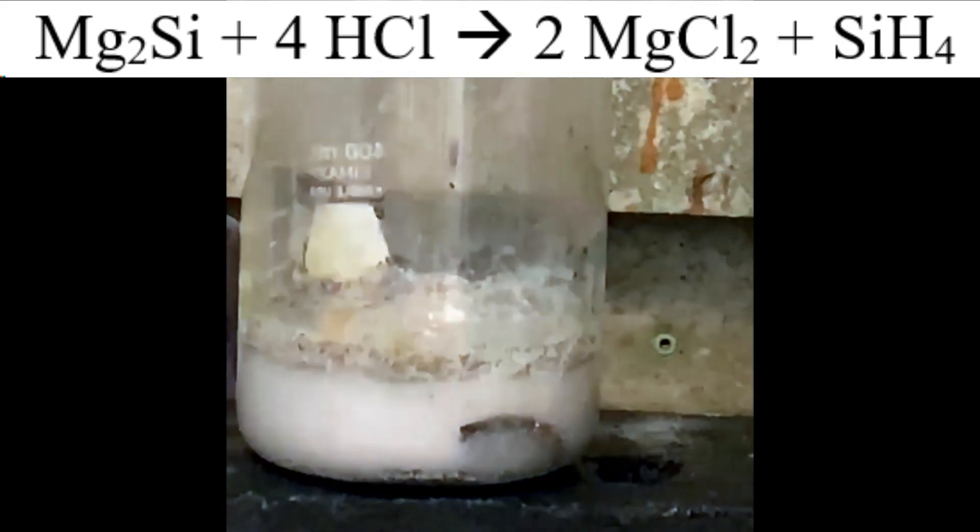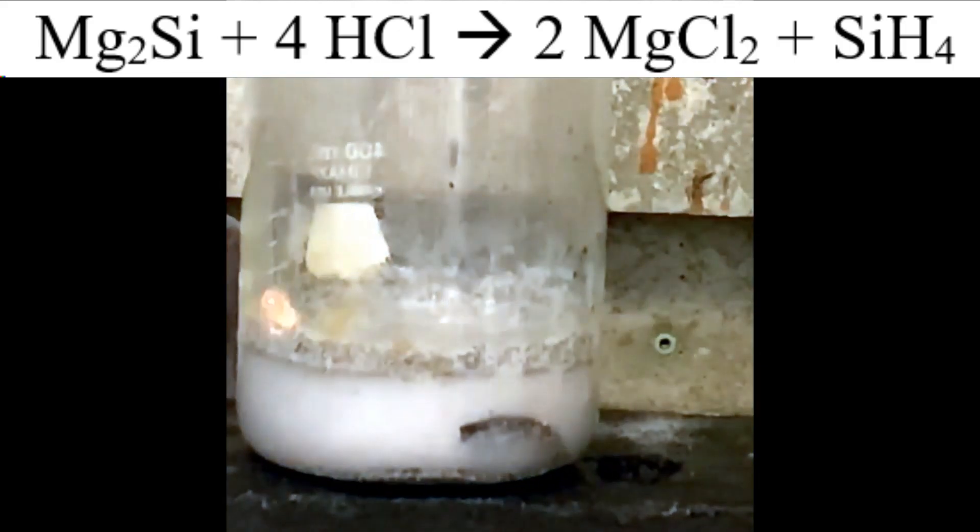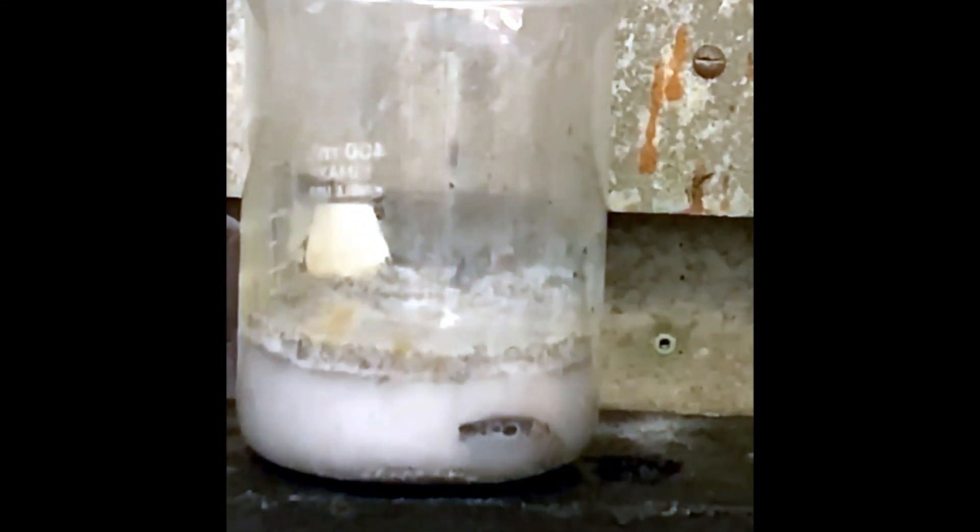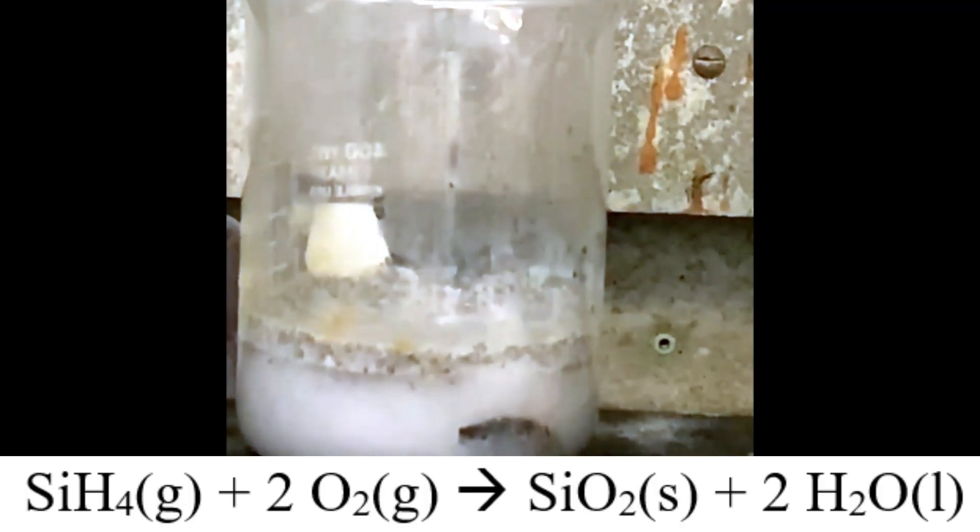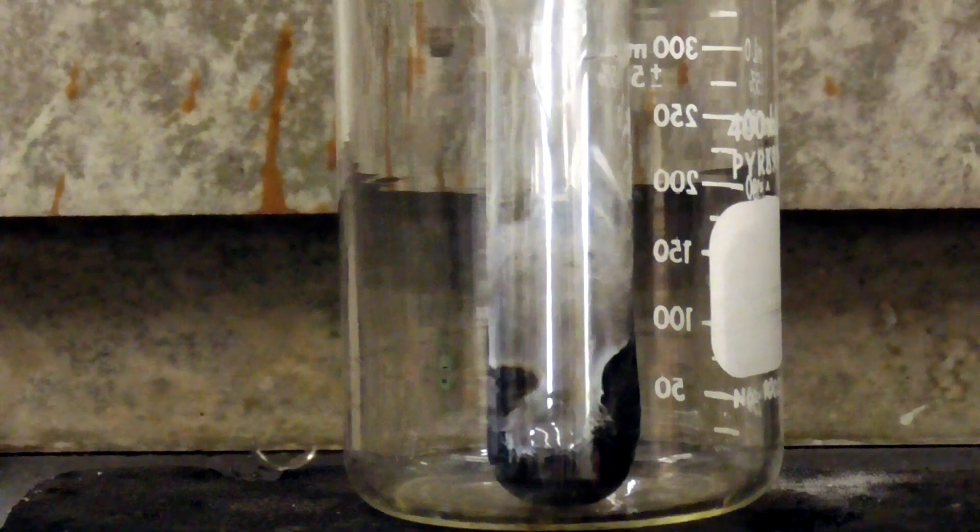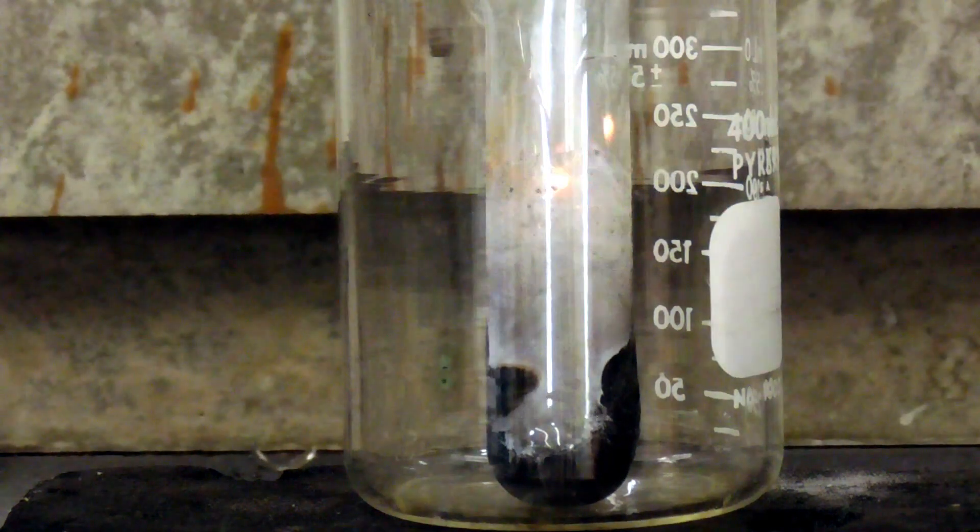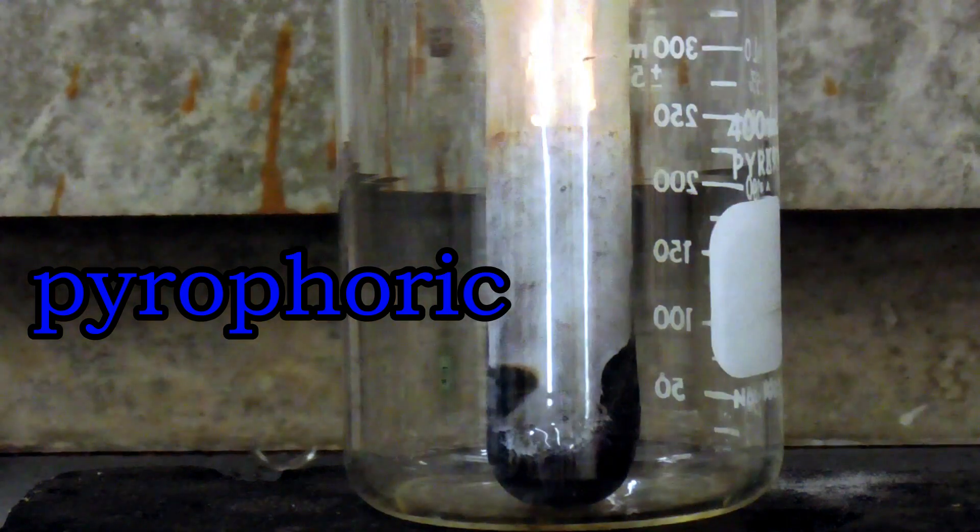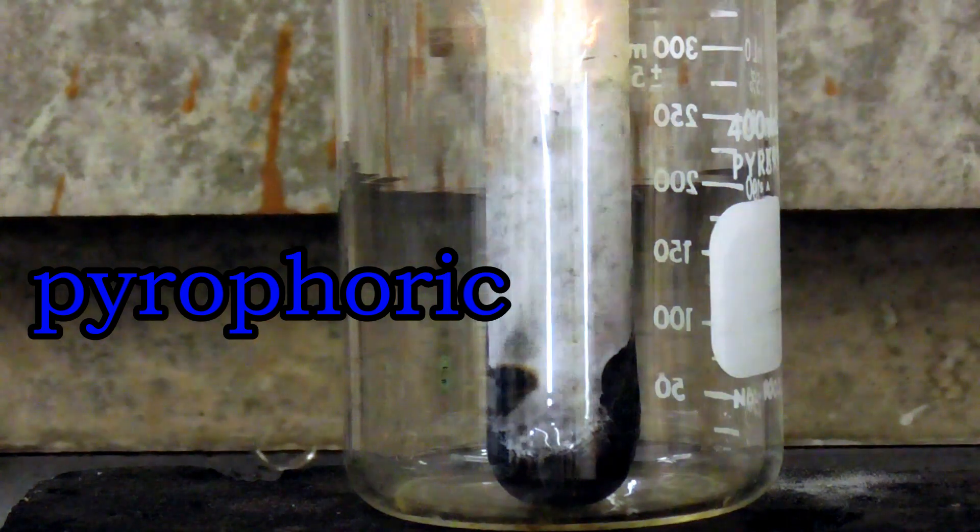Interestingly though, silane gas does not need a source of ignition to burst into flame. It spontaneously reacts with oxygen. The chemical reaction that drives this flammable process is seen below. Substances like silane gas, which spontaneously ignite when exposed to the air, are said to be pyrophoric. I think it's really neat that a pyrophoric substance can be made from something as simple as sand.